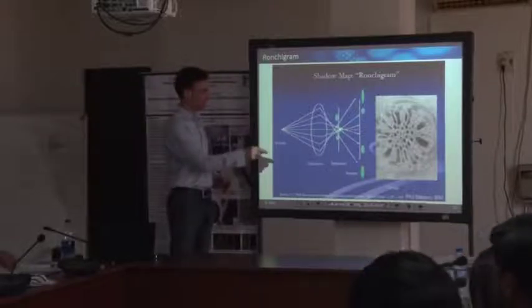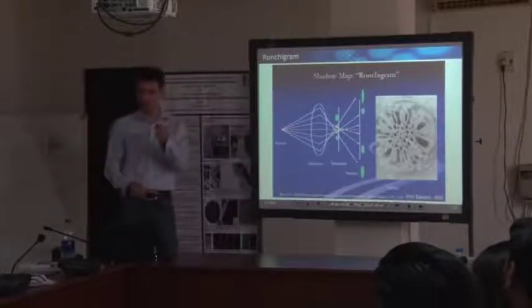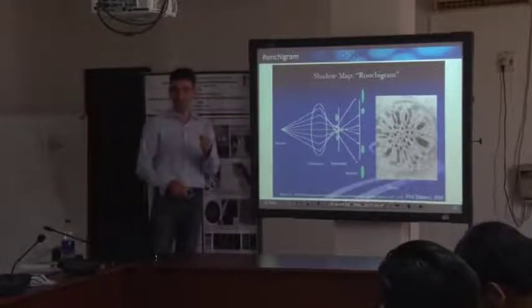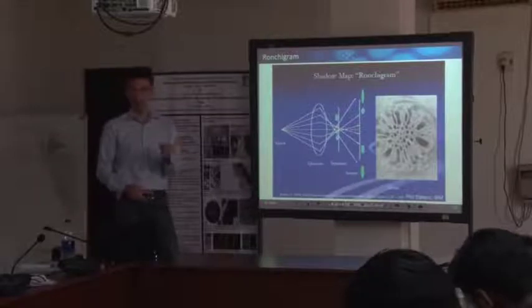And the closer you get, remember that our probe is of the order of a few angstrom. If you focus this very fine inner region of a probe onto your sample, just assume that it's only 1 angstrom for a probe corrected microscope, then this inner part will just hit a single atomic column.